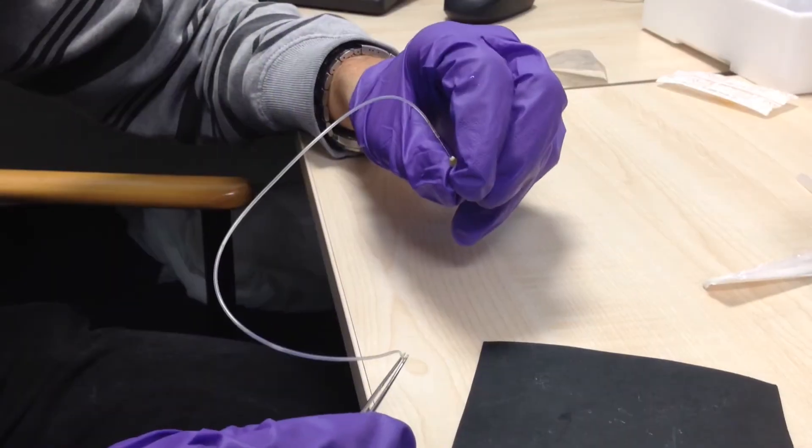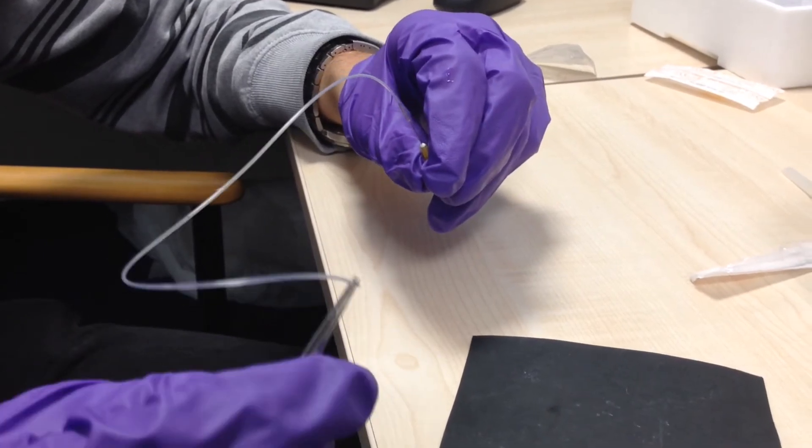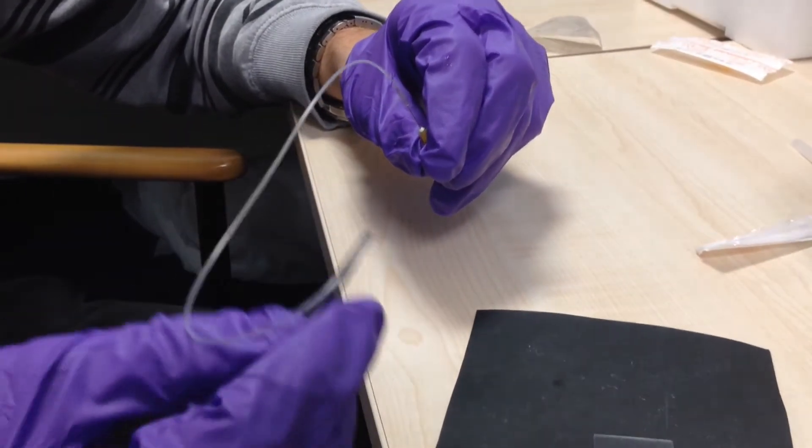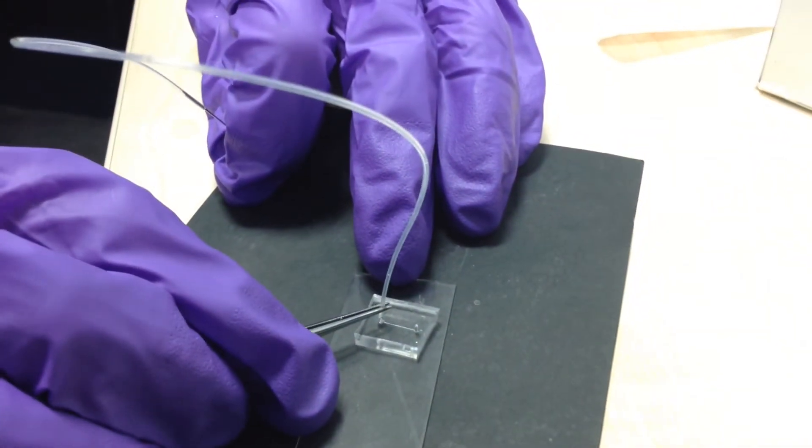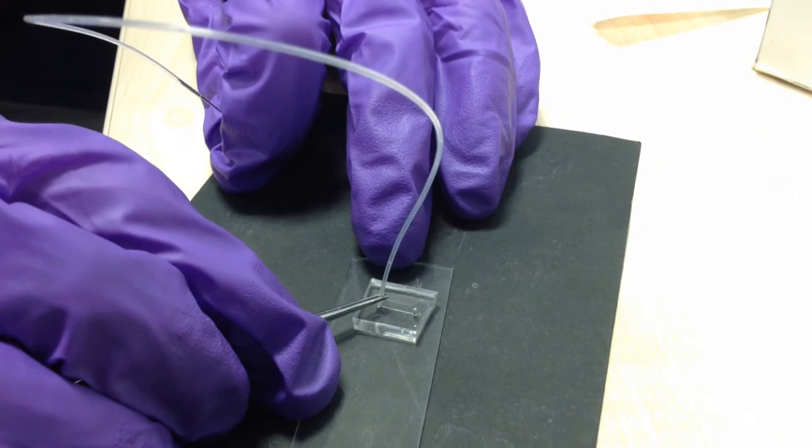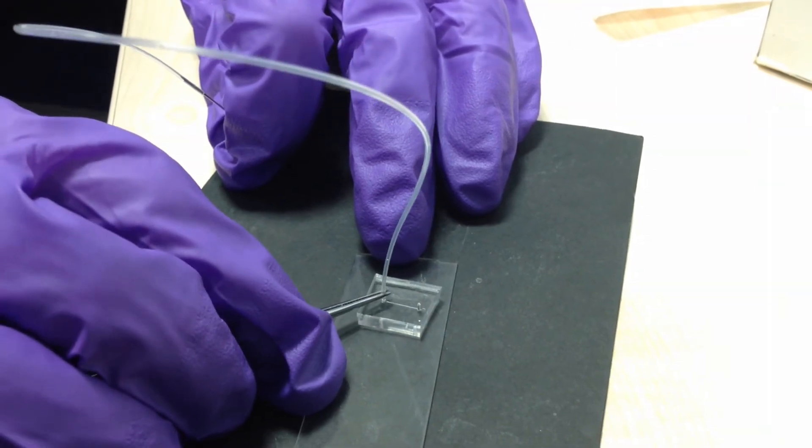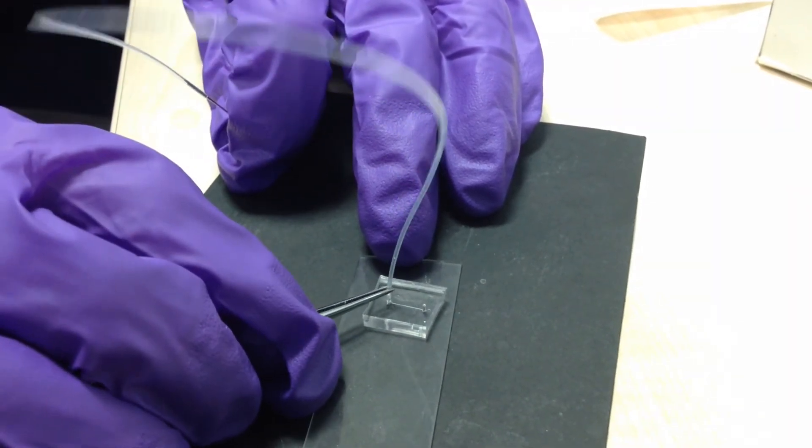Once you've attached the needle to the tubing, attach the other end of the tubing to the microfluidic device. Just take a pair of tweezers and gently push the tubing into the hole in the device. You can give it a quick wiggle to make sure it's in properly.